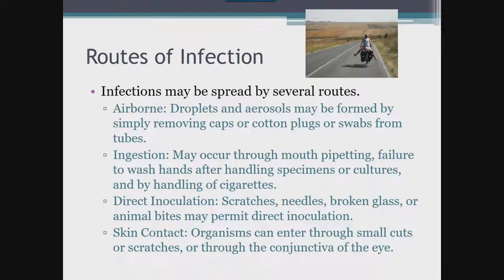Understanding how you can be infected within the laboratory helps you understand how infection controls can be effective to ensure your safety. Infections may be spread by four main routes, with the actual occurrence depending on the virulence of the infecting agent and the susceptibility of the host. The first route is airborne, where droplets and aerosols may be formed by simply removing caps or cotton plugs from tubes; breakage in centrifuges can also cause serious concern. The second route is ingestion, through mouth pipetting, failure to wash hands, or handling cigarettes. The third is direct inoculation caused by scratches, needles, or broken glass. The fourth is skin contact, where organisms can enter through small cuts or scratches or through the conjunctiva of the eye.